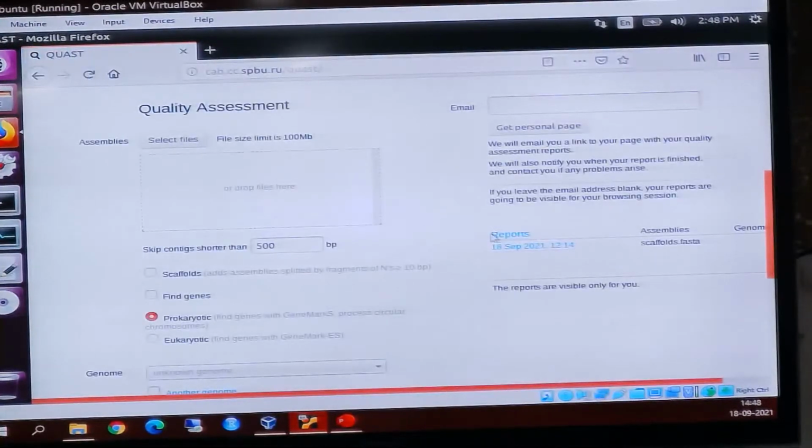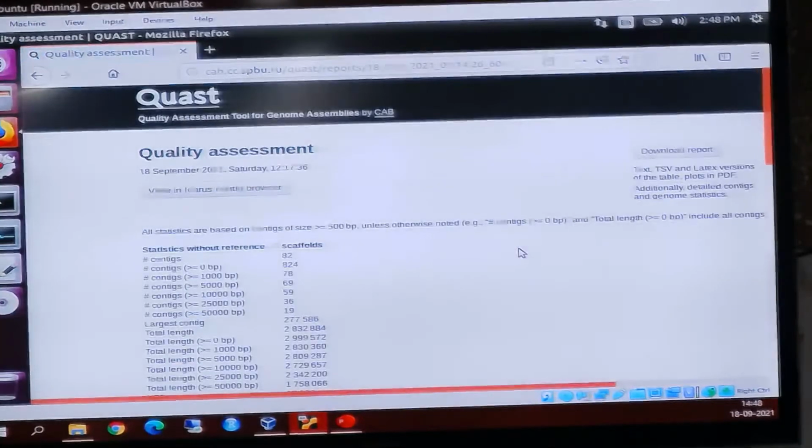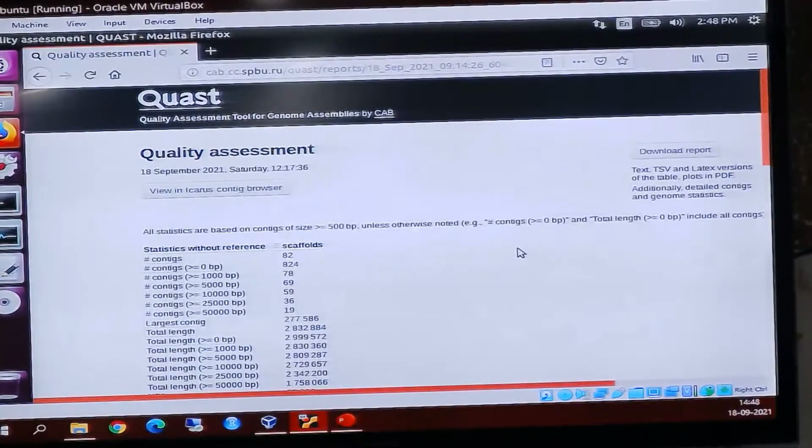So try to refresh your page. The message won't go away. Okay. And at the same place, if the in progress is not showing, then try to click that blue button. We have to open reports. Reports. That is it will show.